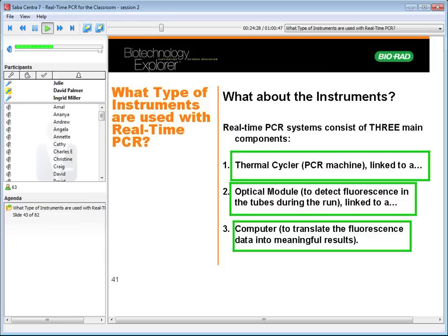So now on to what does real-time PCR data look like and what are melt curves? So this is some actual real-time PCR data. You can see it looks very similar to that theoretical data that I showed you earlier. Each trace has got a nice sigmoid shape. There's amplification. And there's a left-right shift on these curves. The further towards the left the curve is, the more DNA it has. Curves over towards the right have a lot less DNA. And the reason for that is these curves essentially have a head start. They started with more DNA, so they're going to amplify earlier.